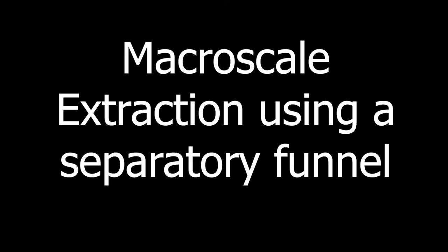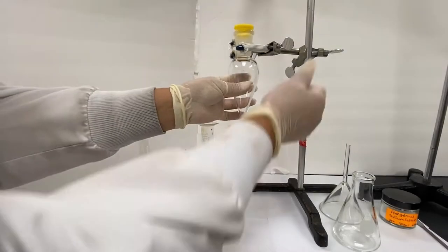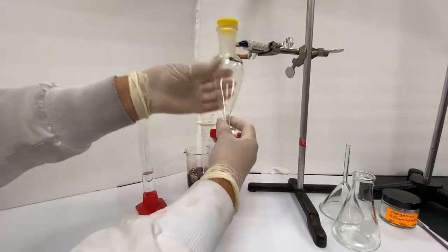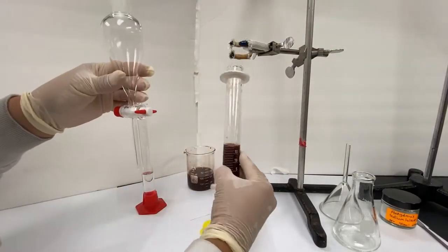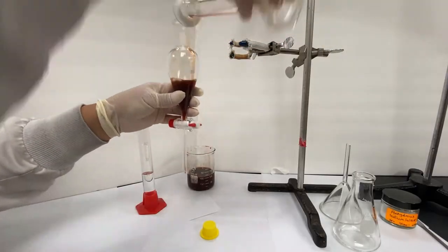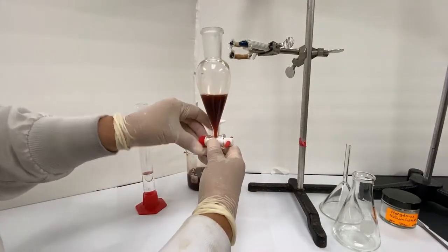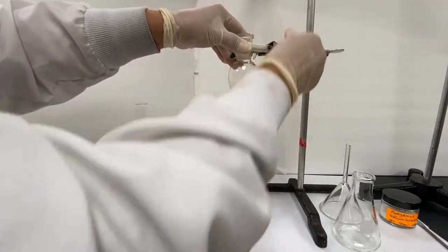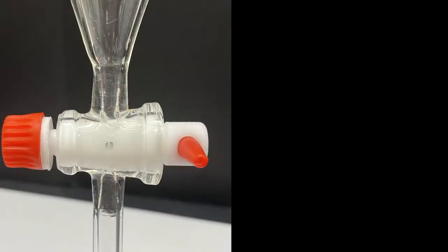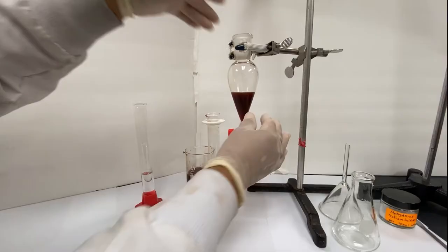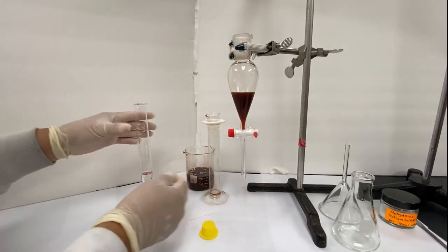Macro scale extraction using a separatory funnel. First, add 20 milliliters of brewed tea to the funnel. Be sure that the stopcock is closed. You can make sure it's closed by making sure the hole in the plastic is about 90 degrees off from vertical. Here's what it looks like closed, and here's what it looks like open.